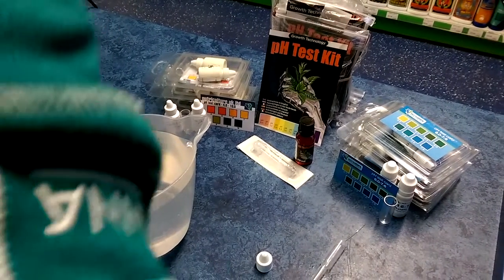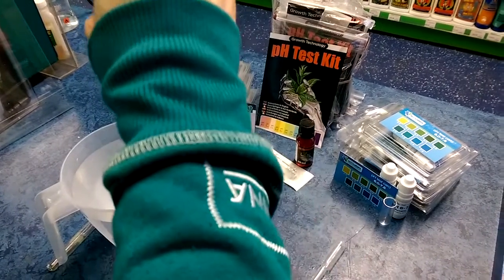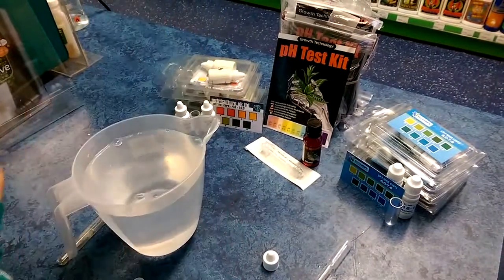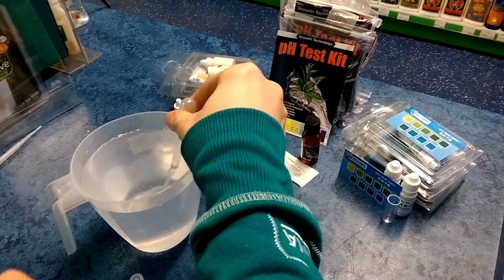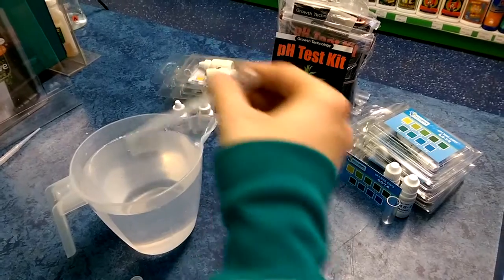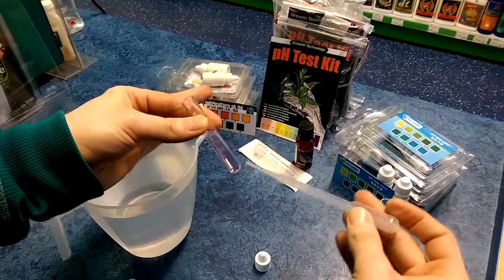We're going to apply approximately a mil of pH up, which is extremely high for this requirement — we'll see how high it goes. So again repeat the process: empty the tube out completely so there's nothing in it, then apply a sample of the water into the tube.